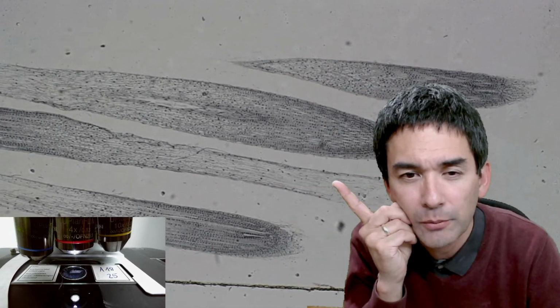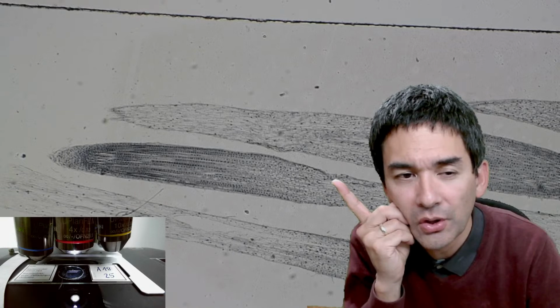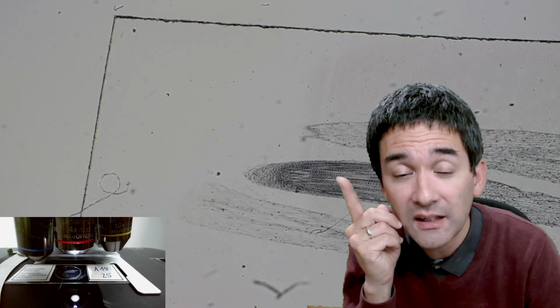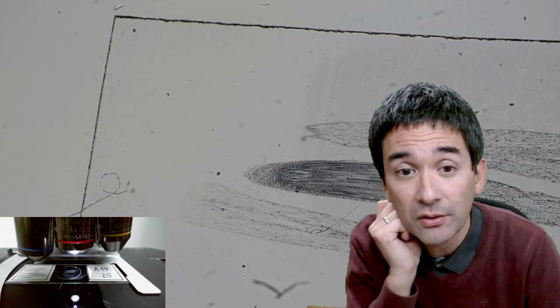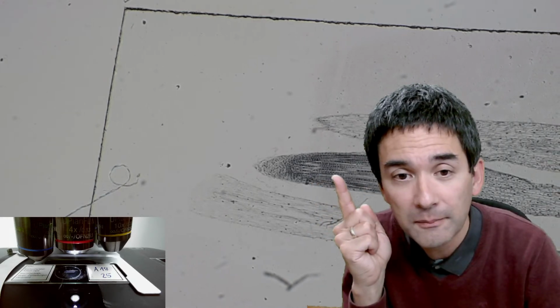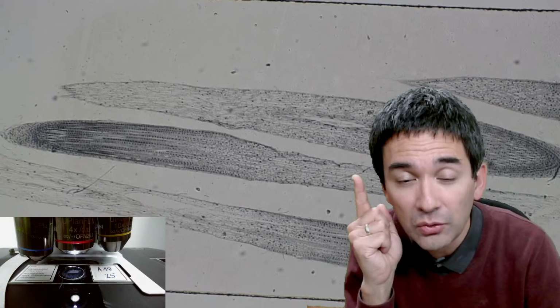It's actually much brighter. And the reason why it's so dark is of course because over there there are many nuclei. So the density of the cells is quite high here because the cells are smaller and there's simply also more cells here. So if you want to find some dividing cells, this is the place here at the tip that we have to look at.